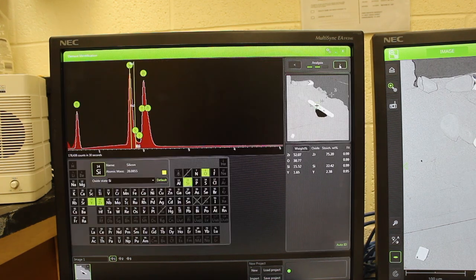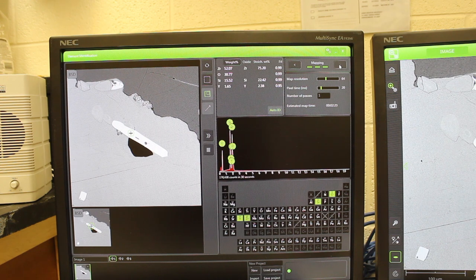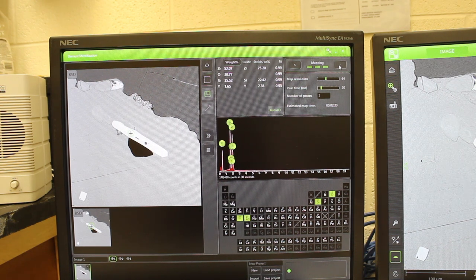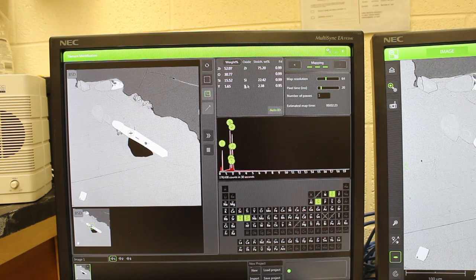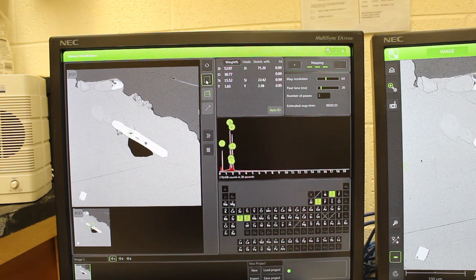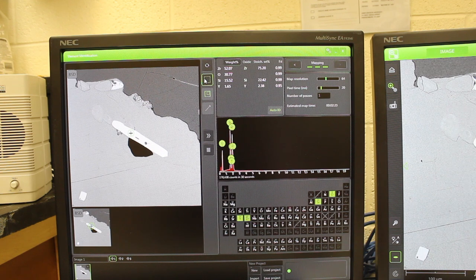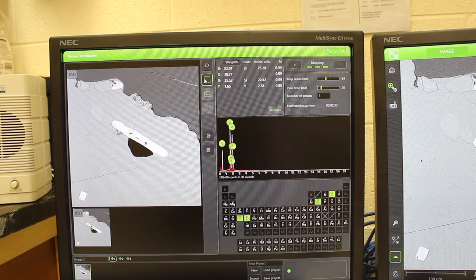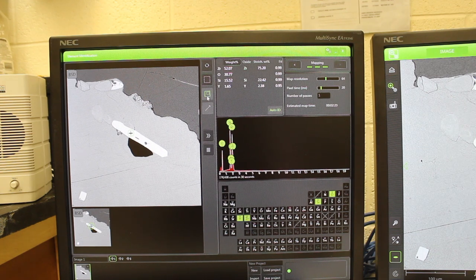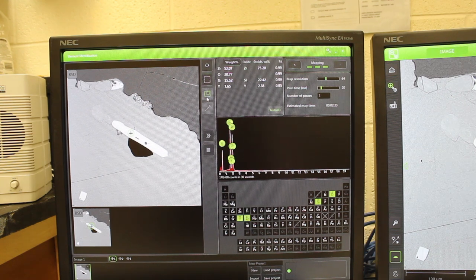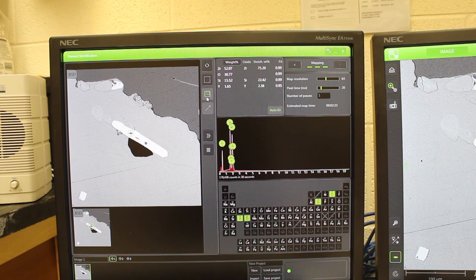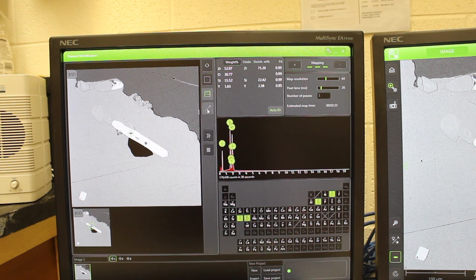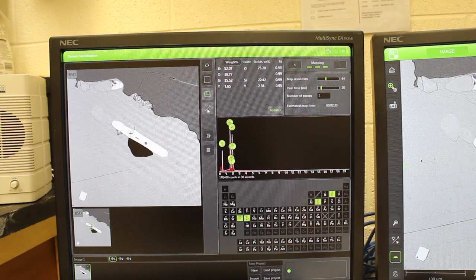If we go to the third window, this is the mapping window, and we can either use this to make a map of the entire area, which is this button right here, or make a map of part of the area, which is this button, or make a transect analysis, which is here.